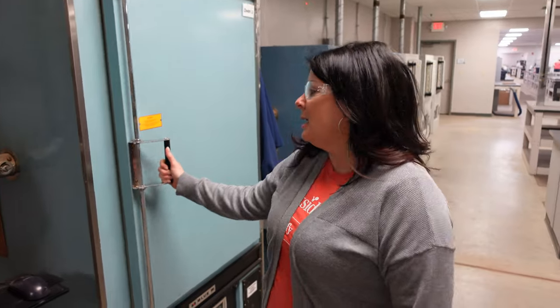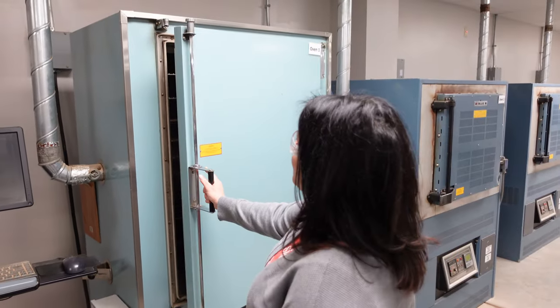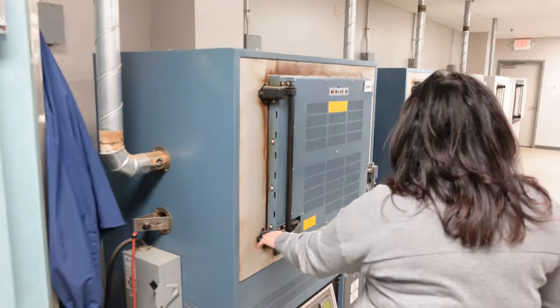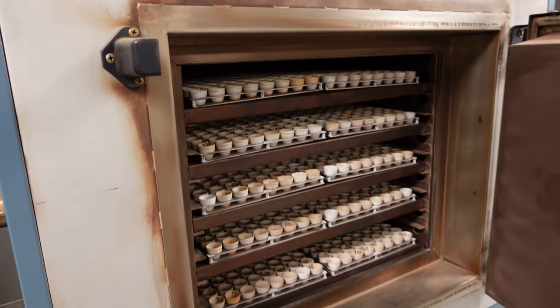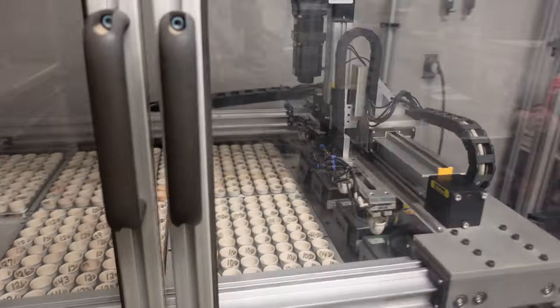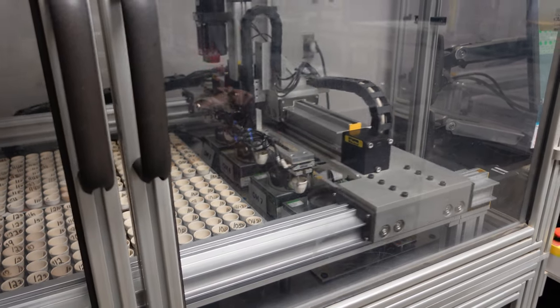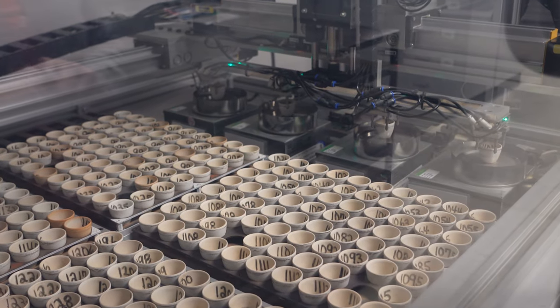This is one of our instrument rooms. In this oven are the organic matter samples — this is where samples dry for approximately one hour. After drying, they go on our organic matter robot where we collect a dry weight. After the dry weight is collected, the samples then go into one of our ashing ovens where they ash at 360 degrees C overnight. In the morning, we come back and place these samples on the same robot their dry weight was taken on to collect their ash weight. The robot picks up four crucibles, takes them to the scale, collects a weight, picks the crucible back up, returns it to its original position, and then picks up the next four samples.